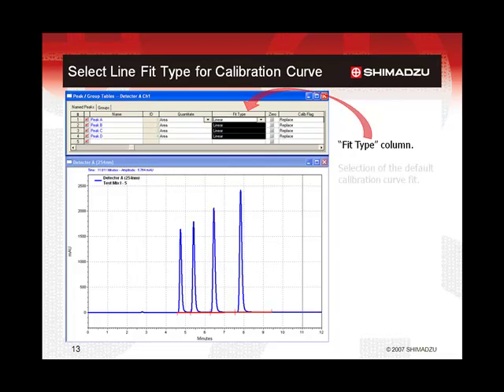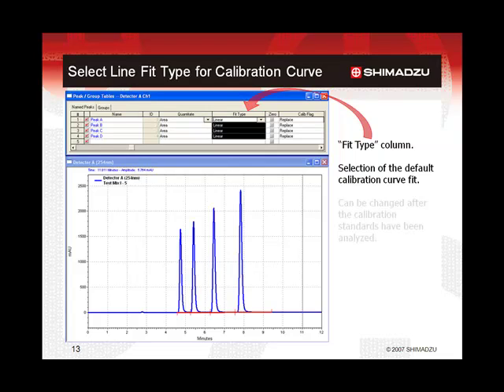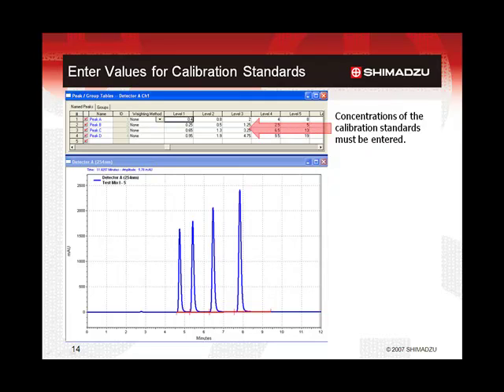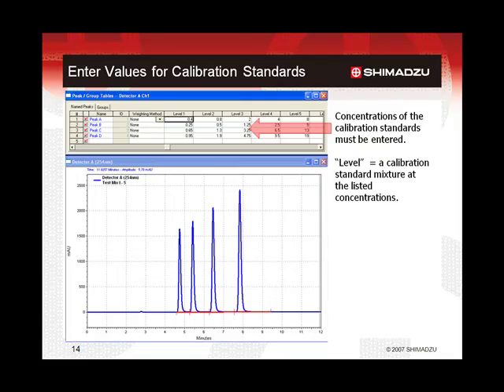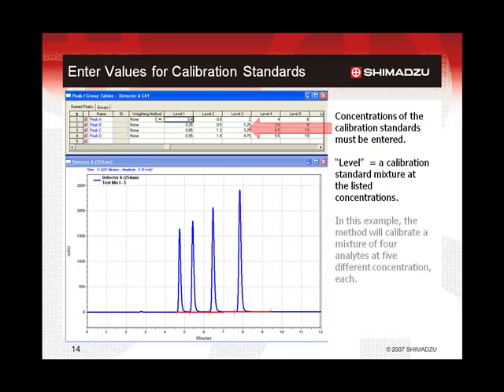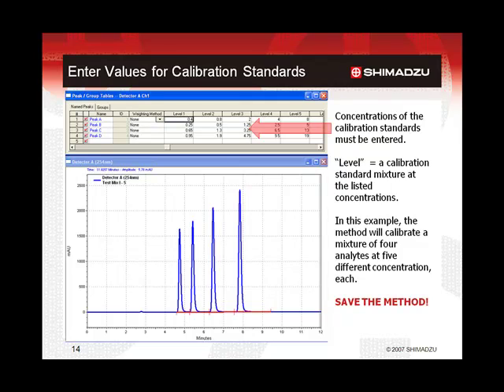The default calibration curve fit may be selected in the fit type column. While this is just an assumption of the correct curve fit before running the calibration standards, it can be changed after the standards have been completed. Scrolling further to the right in the table will come to the level columns. This is where the concentration for each calibration mixture must be entered. A level is a calibration standard mixture at the listed concentrations. In this example, there are four analytes and five levels. Therefore, each standard mixture or level will be analyzed for the presence of the four components, and each level will be expected to produce peak sizes proportional to the amounts listed for the concentrations in this table. This is a very good time to save the method again.